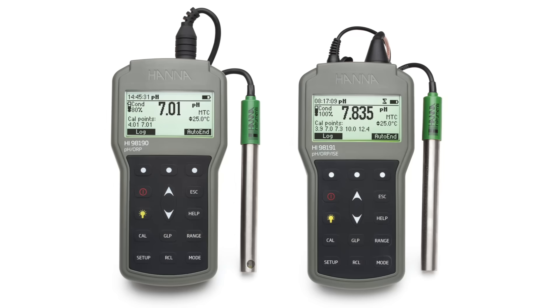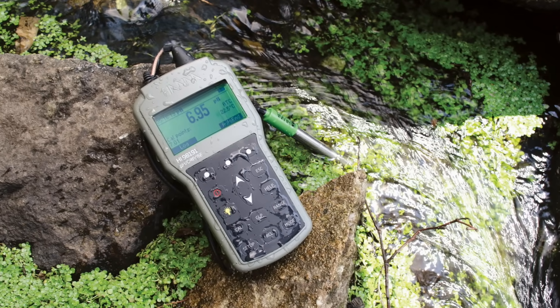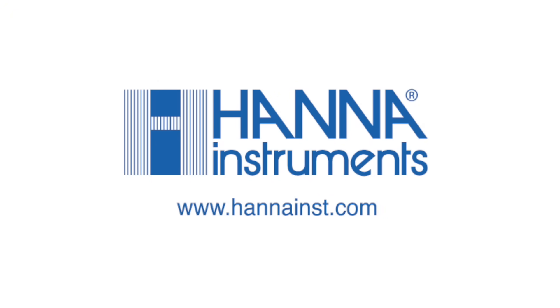Both meters are the latest additions to the growing family of electrochemistry products that Hanna has to offer. These meters are an excellent choice for the customer who is looking for a rugged, waterproof meter that has benchtop quality features with the convenience of a portable meter. For more information about this or any of our other products, please visit our website.